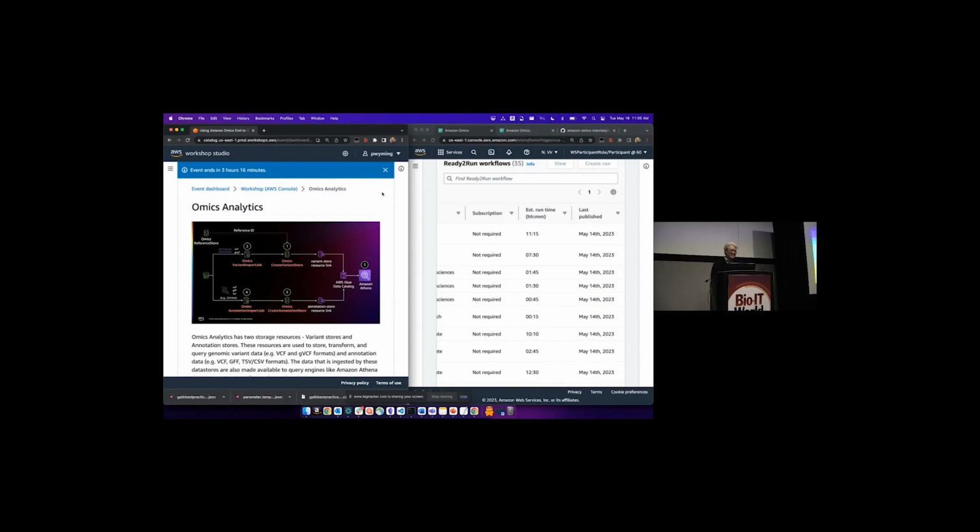Most people want to take this VCF file and query it. Query is a loaded term right now. I want to query it and match that with, say, another database: if you see this single letter change in the genome, this potentially causes this mutation, which then causes this disease, which can be treated with that drug. That's a typical use case. The challenge, of course, is how do you query a VCF file? One VCF file is not that hard, but how do I query a terabyte of VCF files? That's a little more challenging.